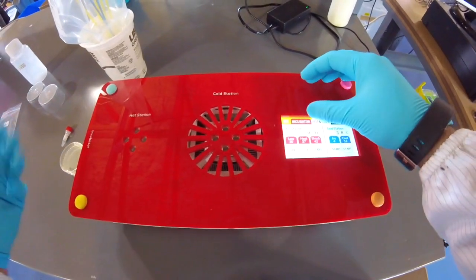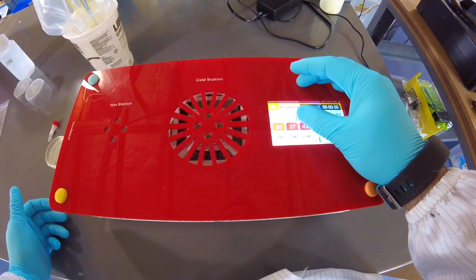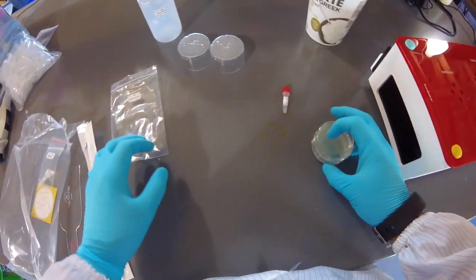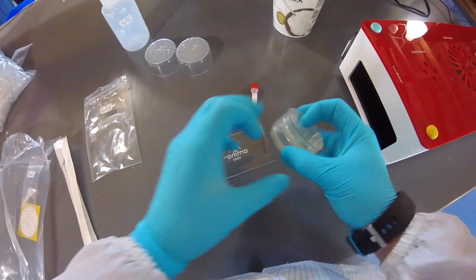Okay, so now you're going to be incubating your plates. So I'm going to go to the incubator tab here. I'm going to press start here. Come on. There we go. Okay, so the incubator is on. So I've got my little paddle here.